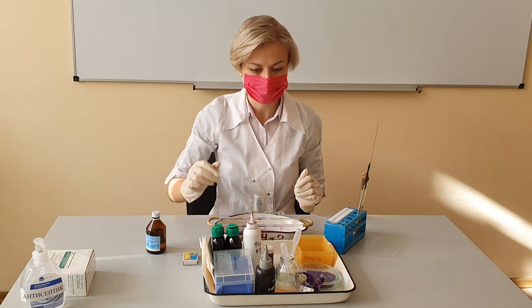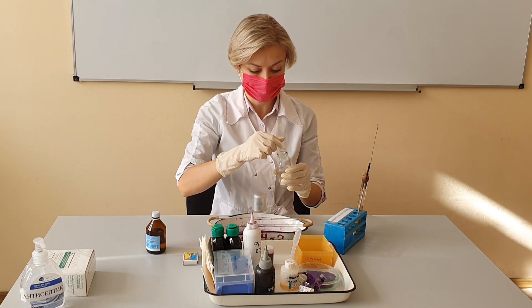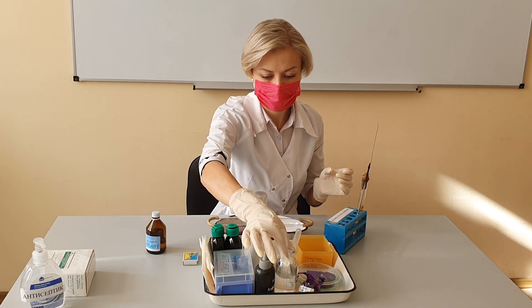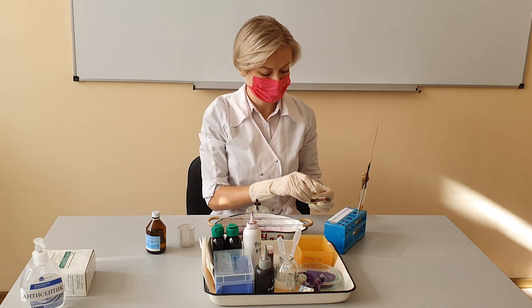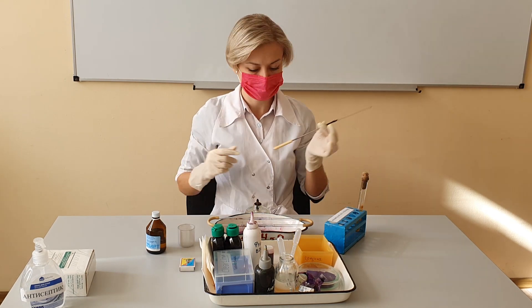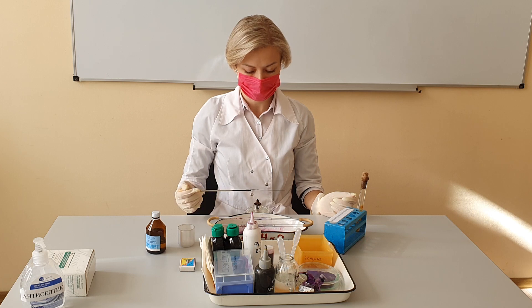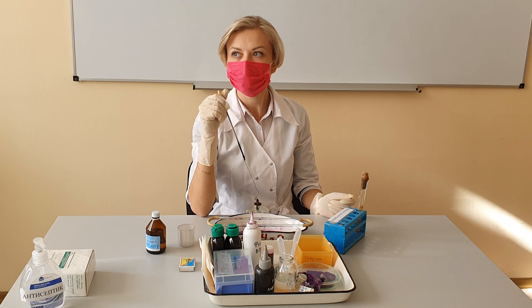After that, we apply one drop of sterile water to a degreased glass slide. You can apply one drop of water to help dry the smear quickly. Next, we need to light the spirit lamp and sterilize the microbiological loop. An alcohol burner or spirit lamp is a piece of laboratory equipment used to produce an open flame. Thermal sterilization of the microbiological loop is a very important step in smear preparation.